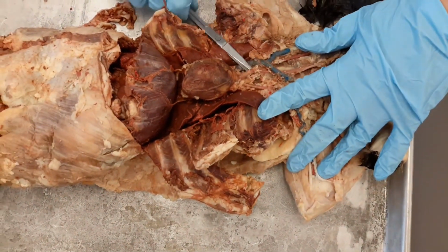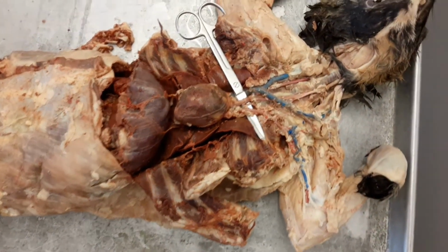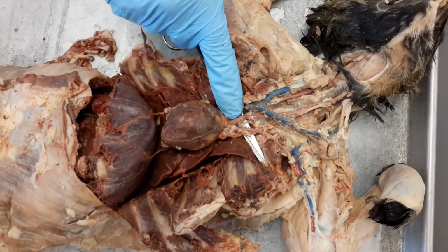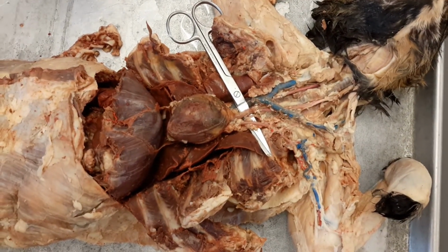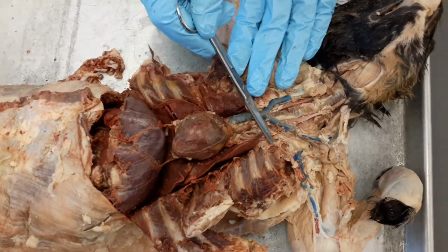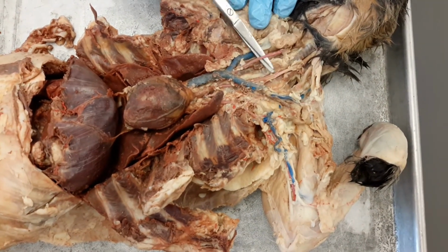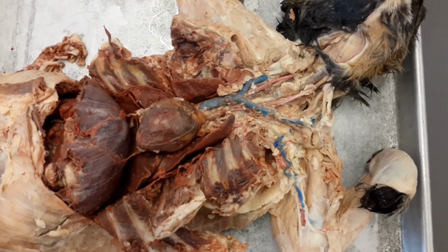So once you clear away a lot of this stuff, you are going to see the 2 branches off of the aortic arch. You can't see the ascending aorta, it's too deep. But cat has 2, right? Brachiocephalic, left subclavian. Then you'll be able to follow this up. So the left subclavian is going to become the axillary, brachial, right? You should be able to see the carotids coming up very easily. Just get started, right? So that's the goal.